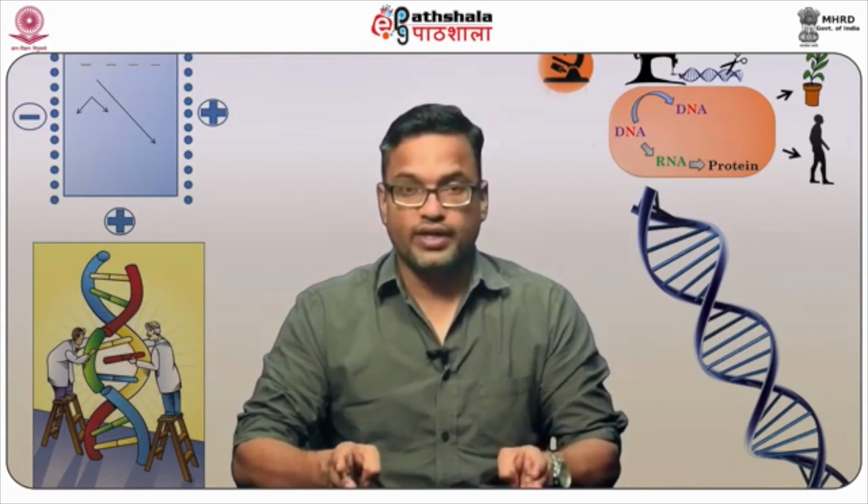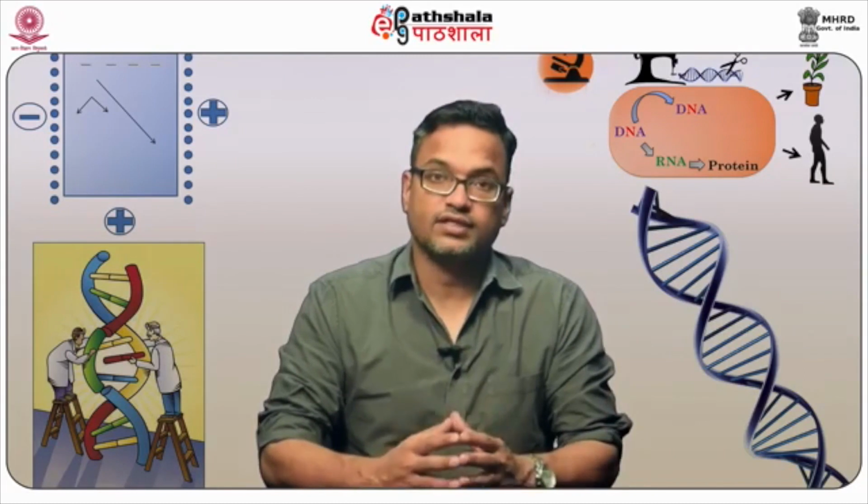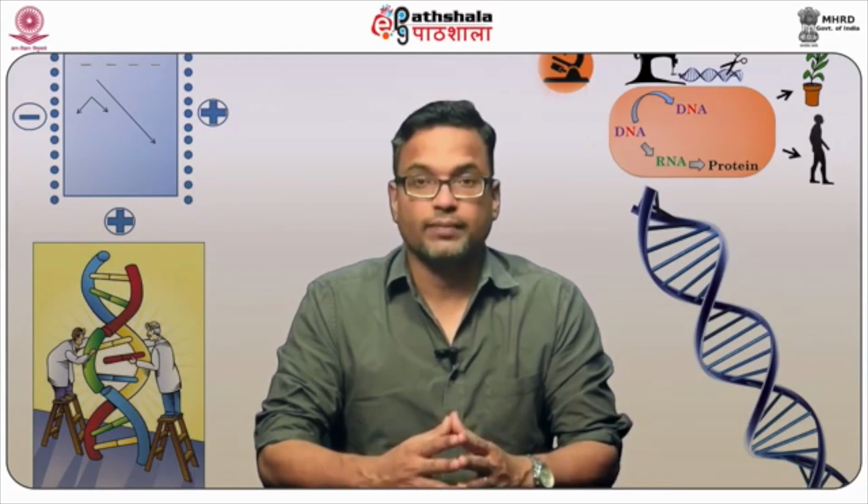That is, the point it got excited to the point it has emitted the wavelength. So that shift is also called Stokes shift. And this entire reaction is very quick. It actually happens in 10 to the power minus 12 seconds, or very quickly.